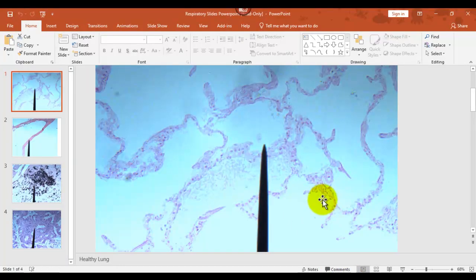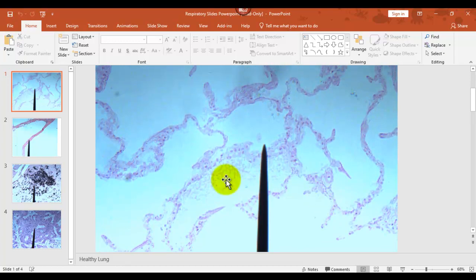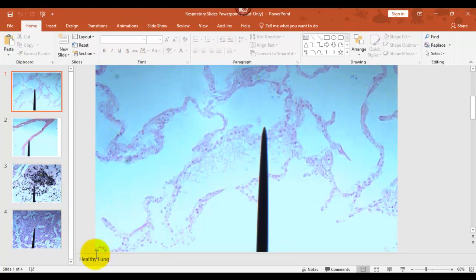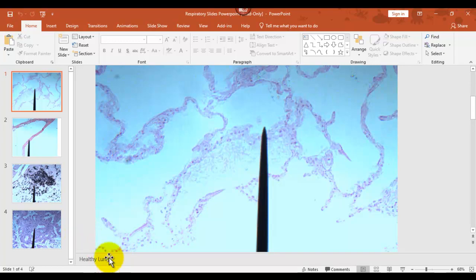And this is the PowerPoint that you have. Now I need to point this out: when you have it in this viewer like this, at the bottom in this corner over here it'll say healthy lung. All the slides have that, they have all the cell types and everything. So these are labeled.